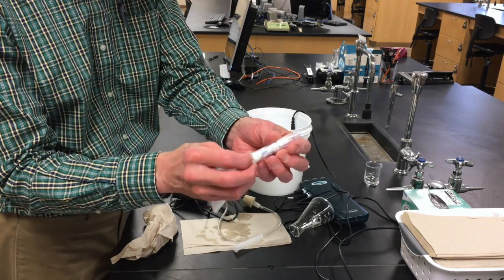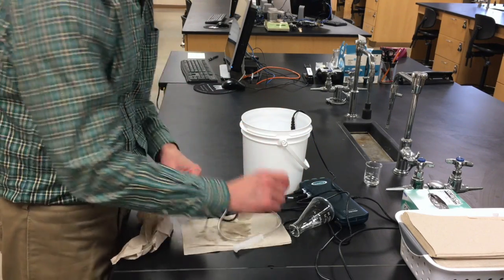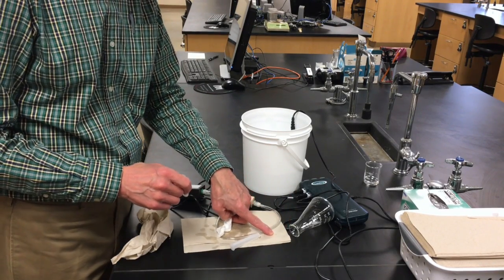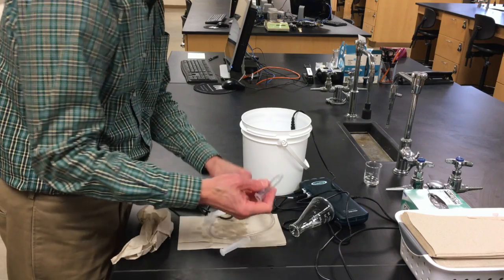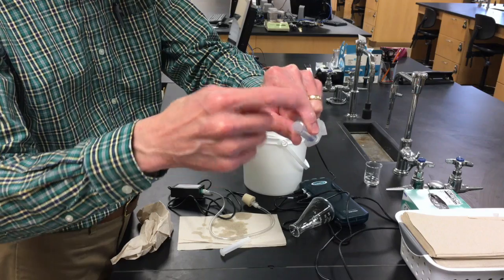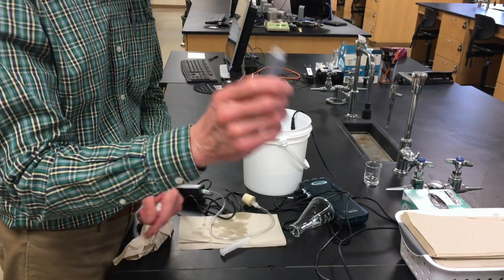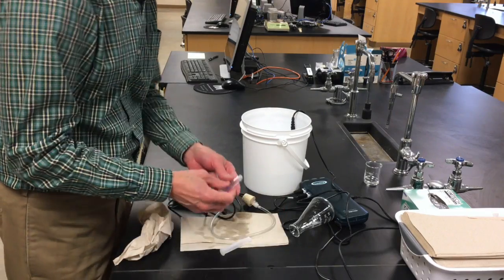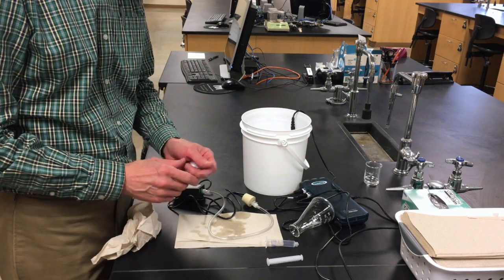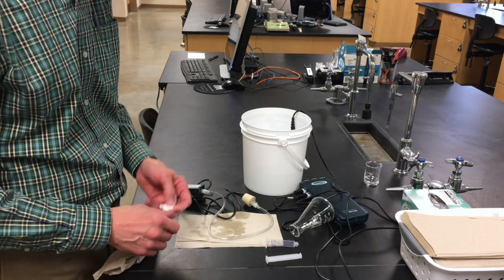To make sure that it's dry, you can bang the tip, and I see that there's still a little liquid coming out when I do that, out of the area in here where the threads are. You want to get the liquid out of everywhere. This has got to be dry. So we do that, and then maybe let it sit on the bench for a few minutes before you go putting it back together and using it for the next liquid.